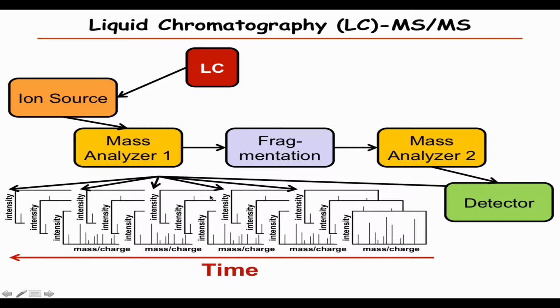What you will see later in the exercise, there are the two data files. They contain a lot of spectra. One can, in maybe a 2-hour data collection, collect 50,000 fragment spectra.